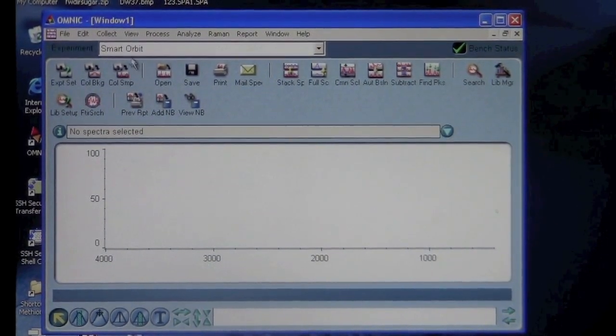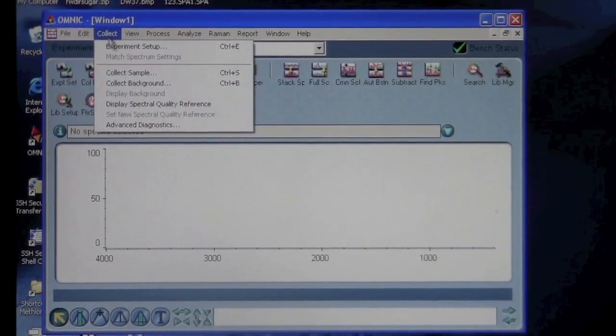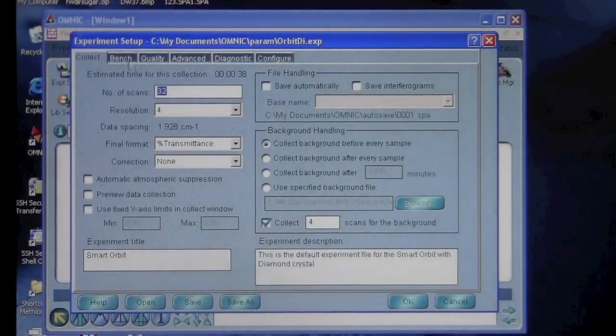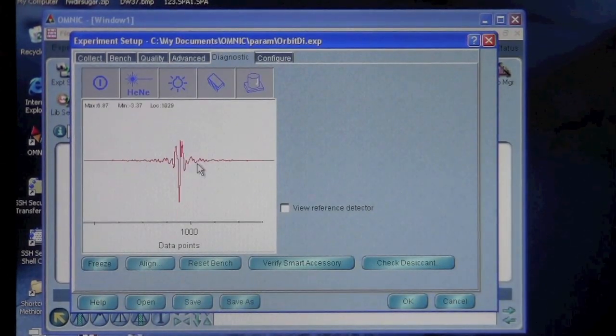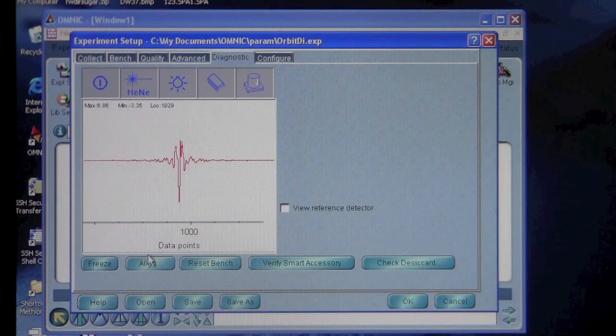The first thing you want to do is go to Collect and Experiment Setup, and you can come over to this Diagnostic tab. You should see a signal. One thing you can do, which I'm not going to do right now, is click Align and it will automatically align the optics for maximum signal.